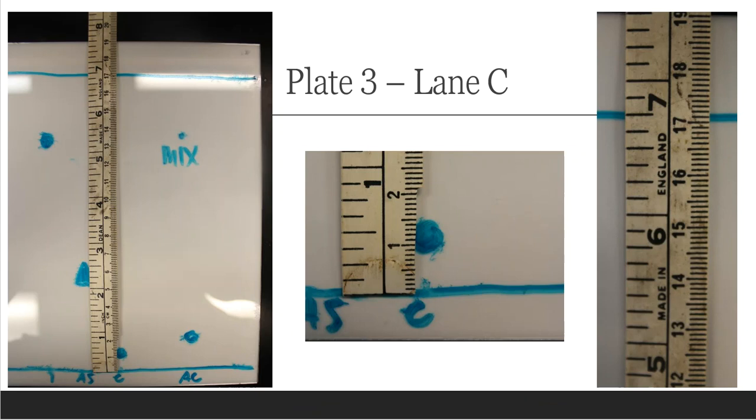Plate 3, lane C, which stood for caffeine. Here, caffeine did not move a lot at all. But over here to the left, you'll see the entire lane. I zoomed in, like usual, to give you this picture. And then I zoomed in here to give you that picture so you can read the mobile phase and the spot lane maybe a little bit better.